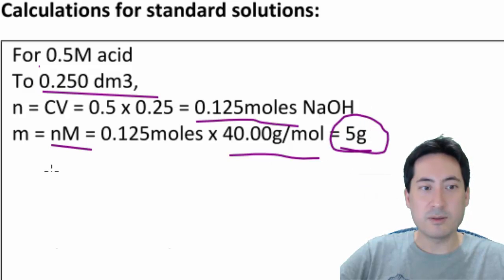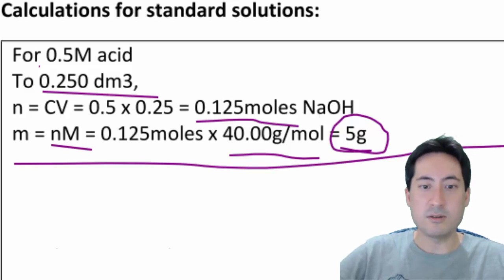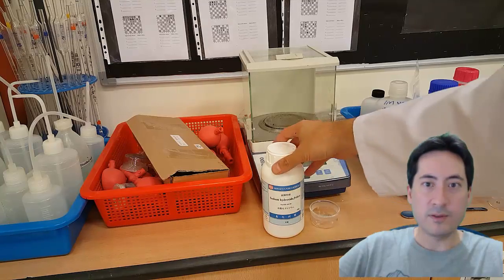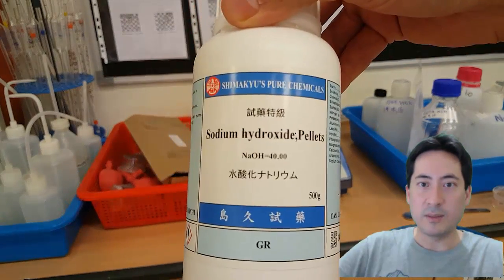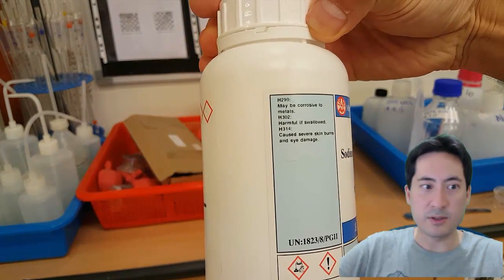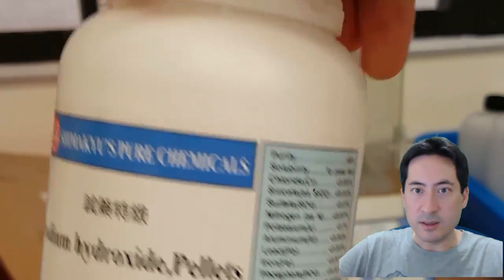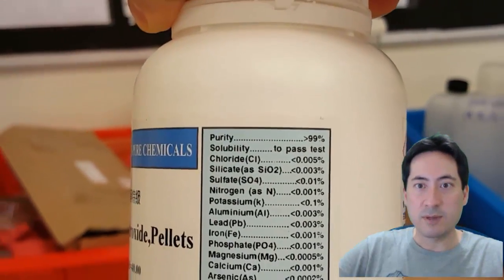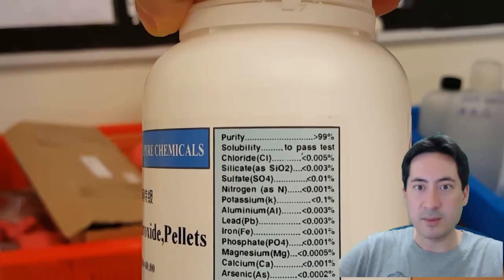So before we go on to the next stage, which is below, let's just do that. So here I've got a metal balance, here's my sodium hydroxide pellets. And you can see here the various accuracies and contaminants.